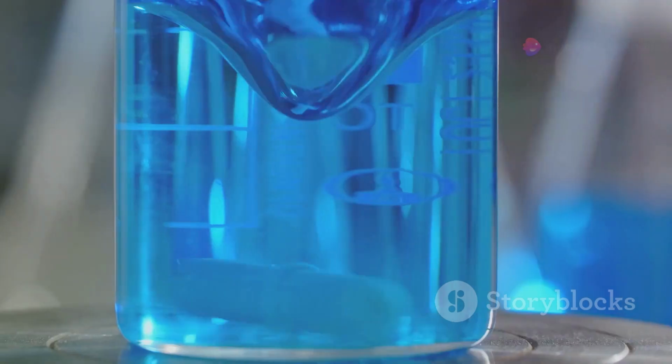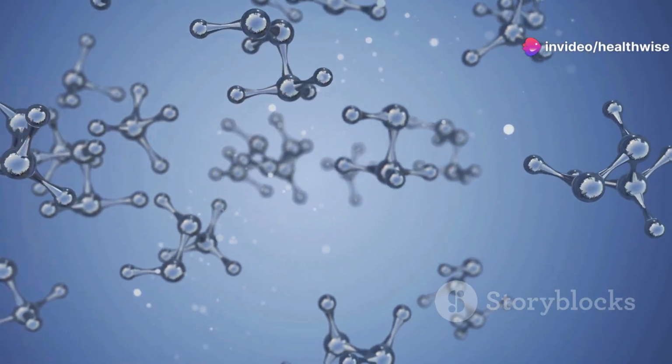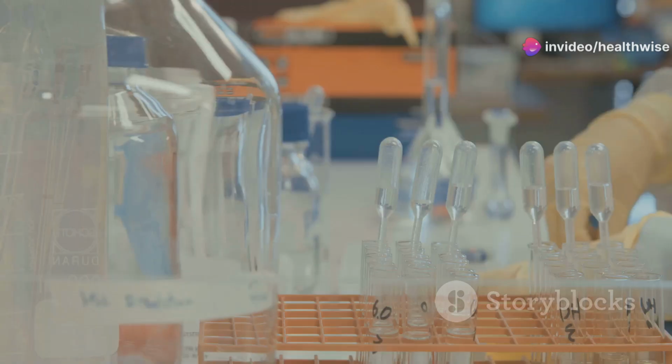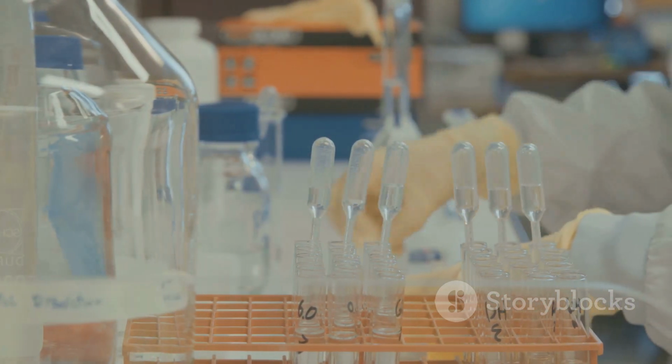Chapter 3. Affinity chromatography, finding the perfect match. This method is like a matchmaking service for molecules. It's all about using highly specific interactions to capture and isolate our target molecules.